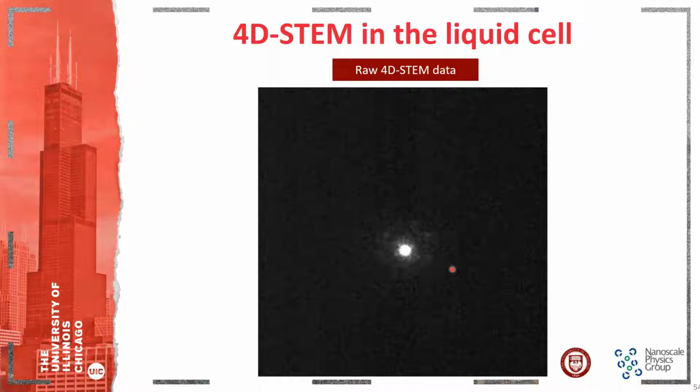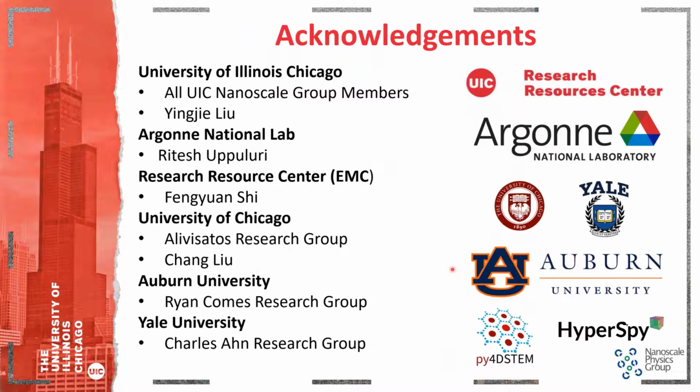And so now this allows us to do analysis where we actually are clustering the 4D STEM diffraction patterns and assess the difference between the remaining crystalline core of those nanocrystals, the amorphous surface layer, as well as the secondary phases that will have formed after the advanced stages of the nanocrystalline corrosion.